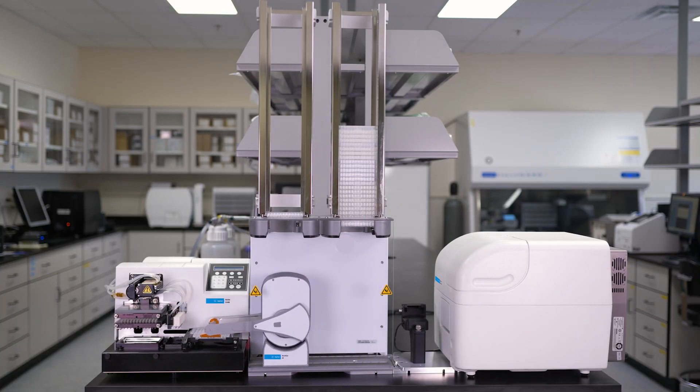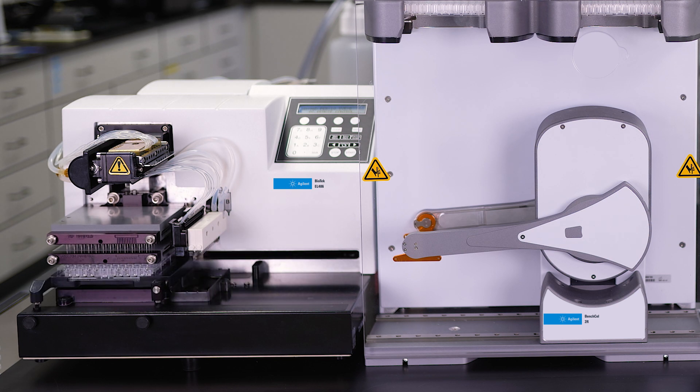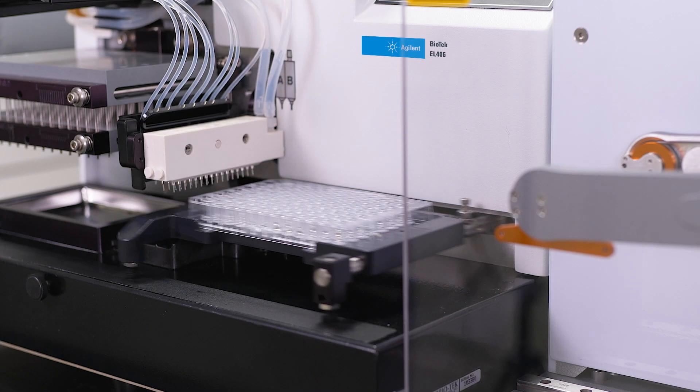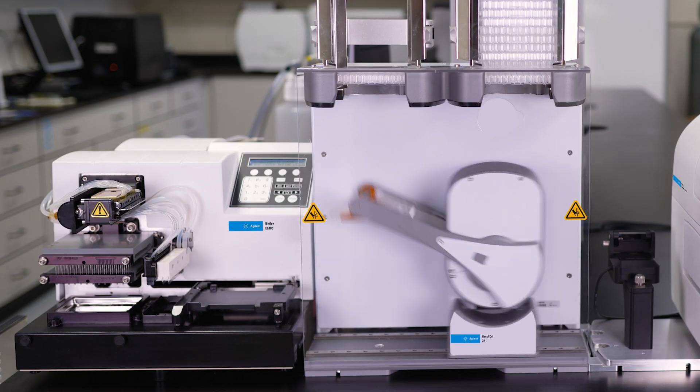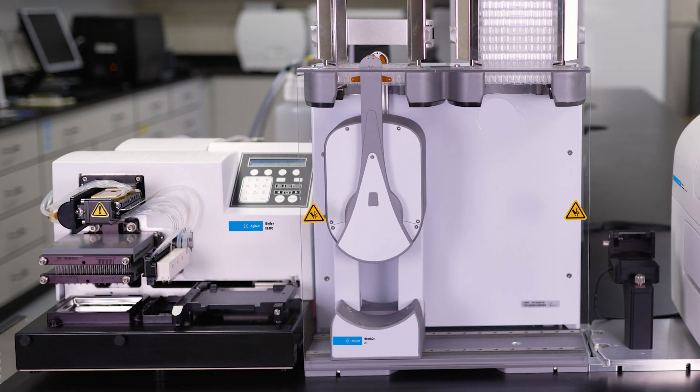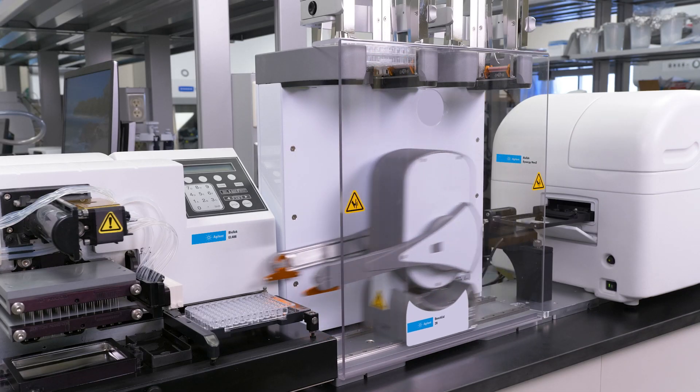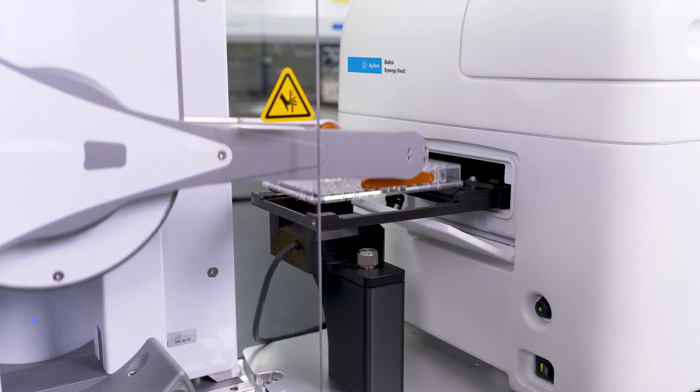Unlike the BioStack however, due to its method of plate movement, the BenchCell can be connected to a liquid handler and a reader or imager at the same time. This allows the combination to enable a wide variety of assay applications including automated ELISA, automated homogeneous or heterogeneous reader-based assays, automated cell fixing, staining and imaging protocols and many more.